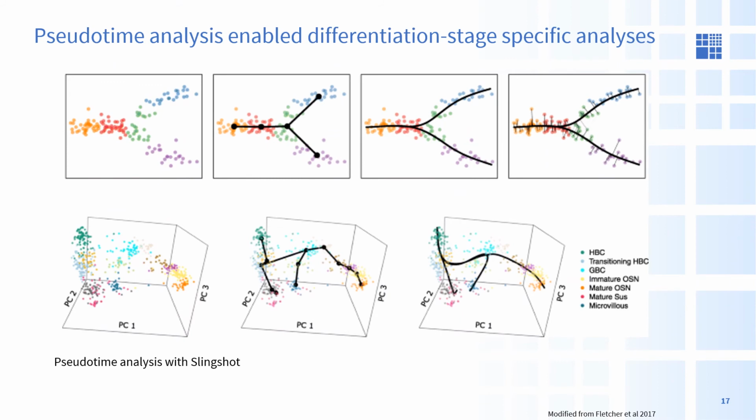Another popular use for single-cell RNA-seq is to perform pseudotime analysis of stem cell lines or other differentiating tissues. Pseudotime analysis enables us to rank cells by their progress along a process of continuous change, i.e. a differentiation process. Here we're looking at the differentiation of the olfactory bulb.